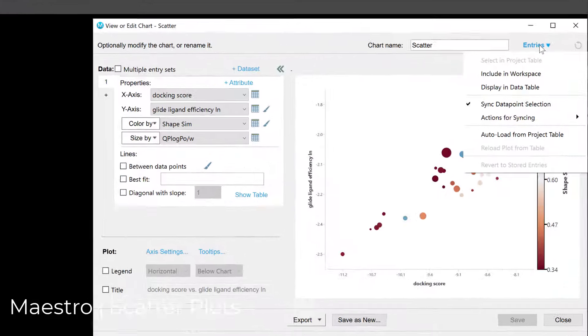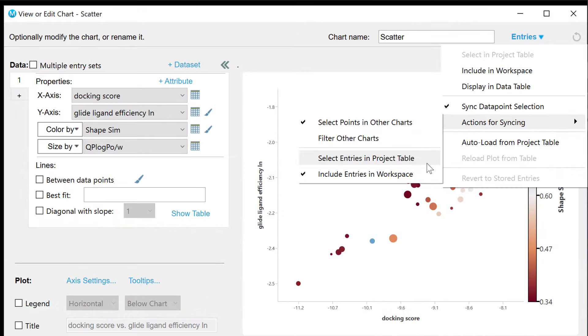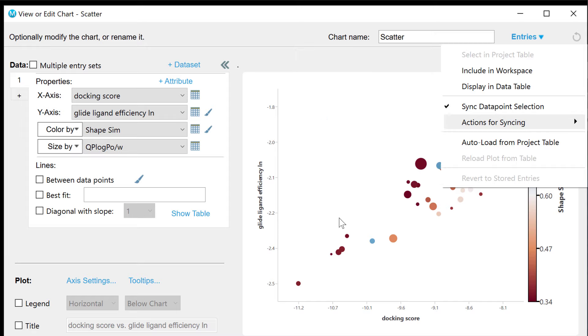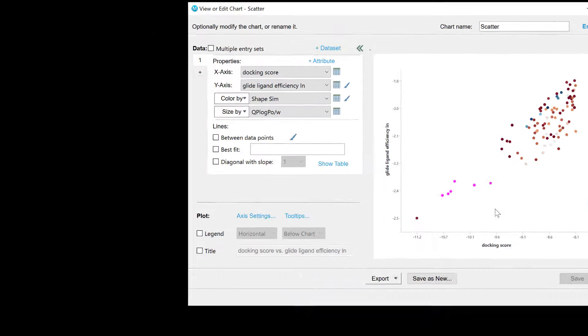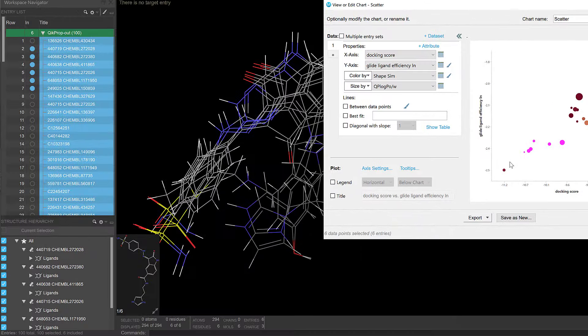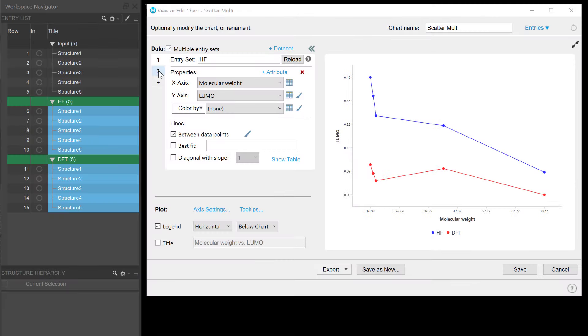In the scatter plots, there is now automatic synchronization between data point selection and project table selections and/or workspace inclusion. And with the new multiple entry set option, one can easily display data from different project table groups in a single scatter plot.